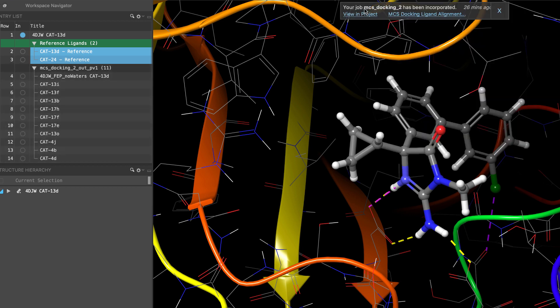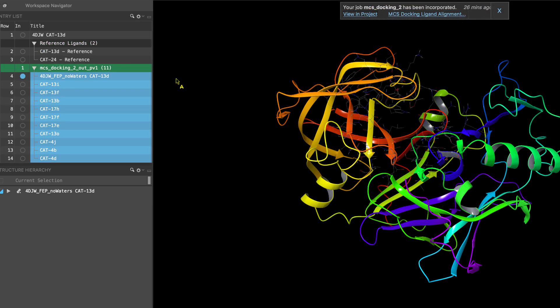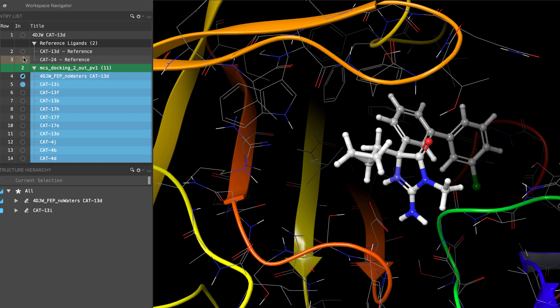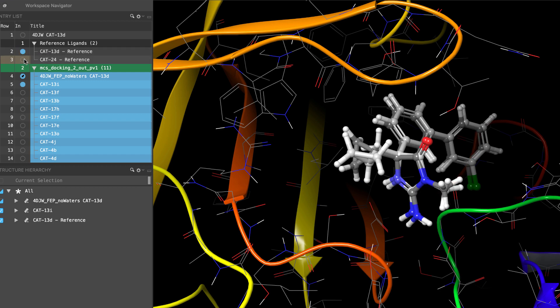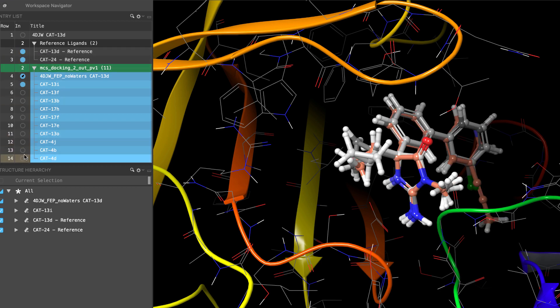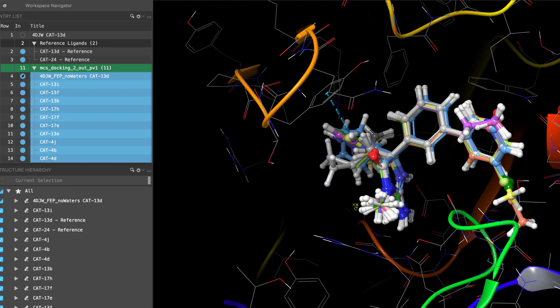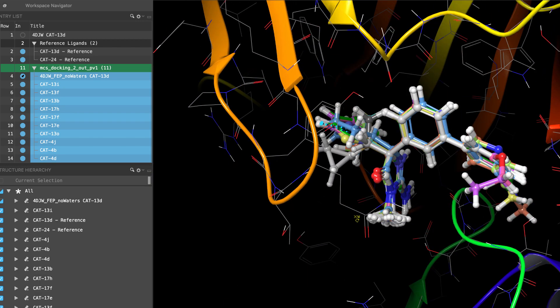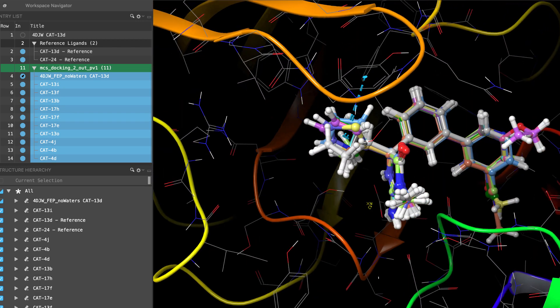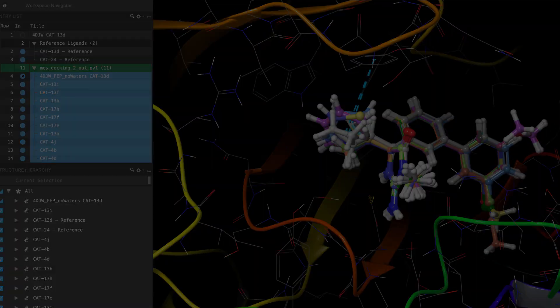Once the job is run, the ligands will appear as poses docked within the receptor binding site and with their MCS nicely aligned with at least one of the references. The poses can then be considered for FEP Plus, among other tasks.